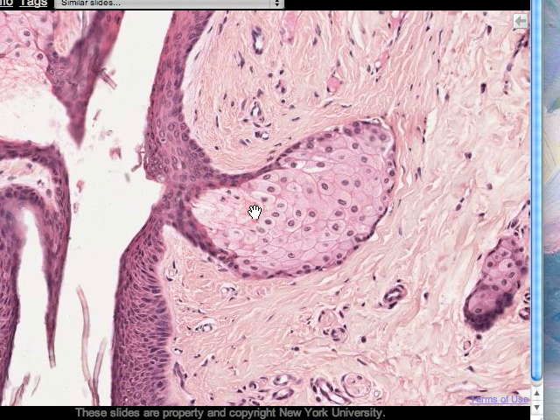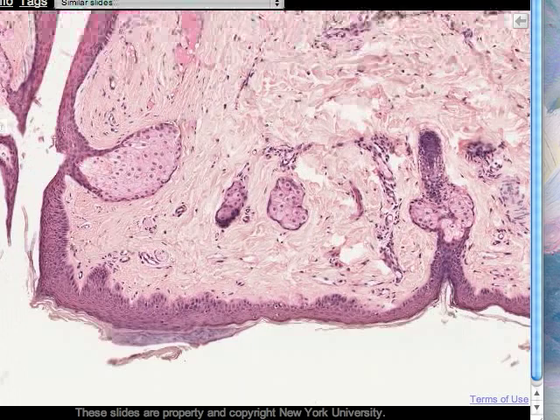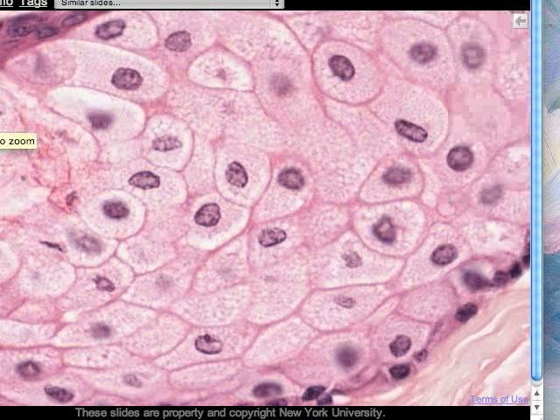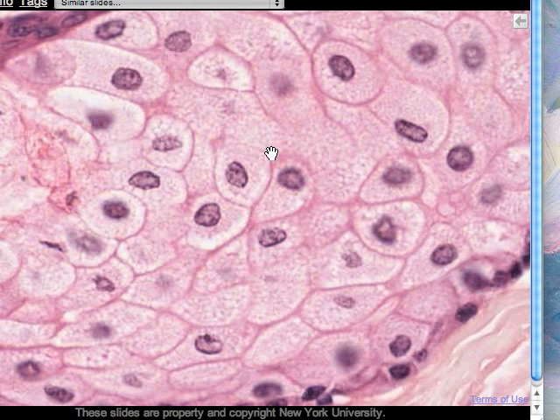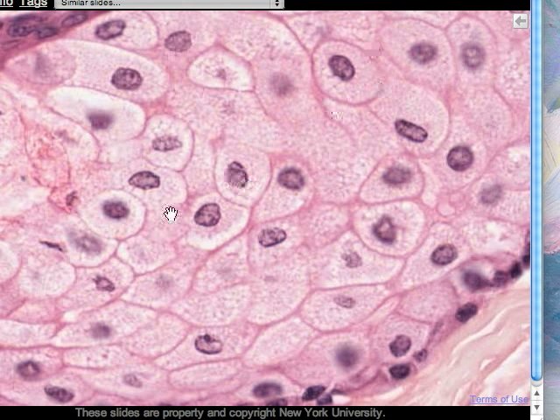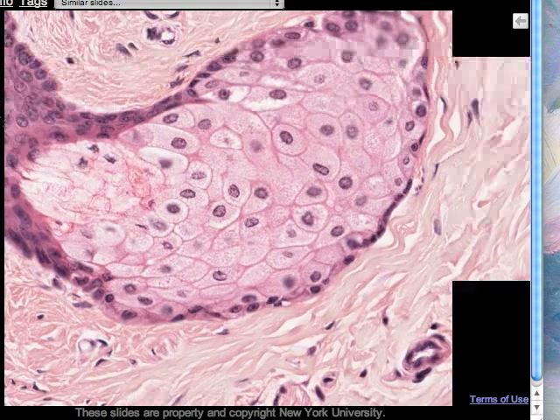One reason to look at the sebaceous glands is that these are places where we can see cells with very strongly stained cell margins. We can see the size and shape of each individual cell in addition to seeing its nucleus, so we can tell the cell shape without having to infer it from nuclear shape and arrangement.